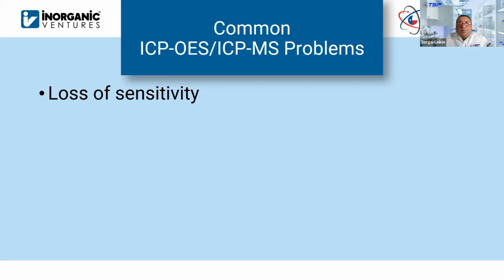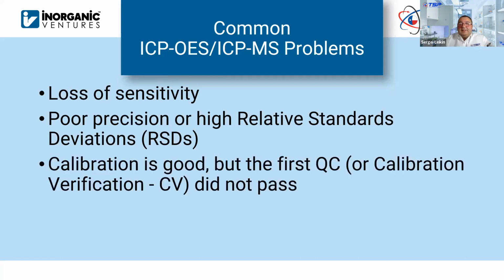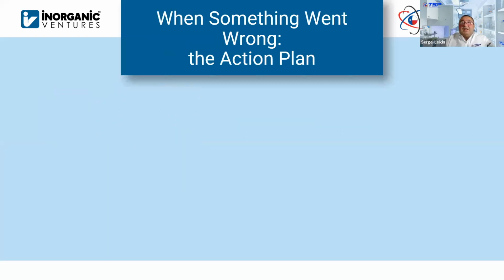So what are the typical problems? Sensitivity loss, or precision. The sensitivity can be okay, but precision suffers. Or we run the calibration, and the first QC did not pass. Let's dig into that and see what can be done, how to address it in a simple way.